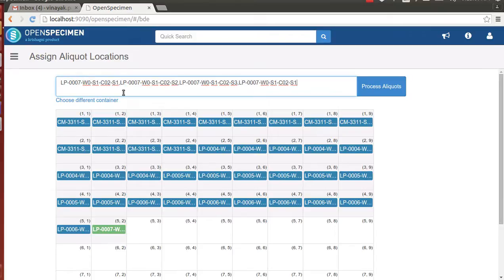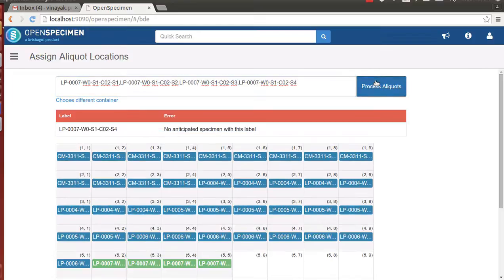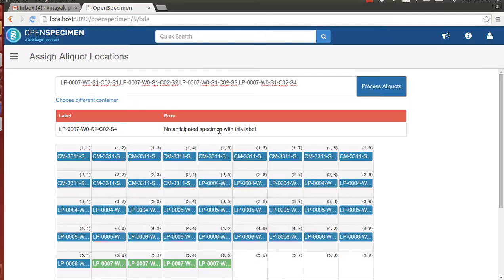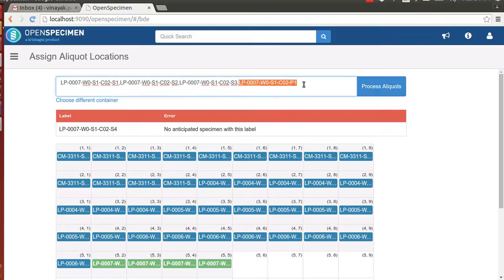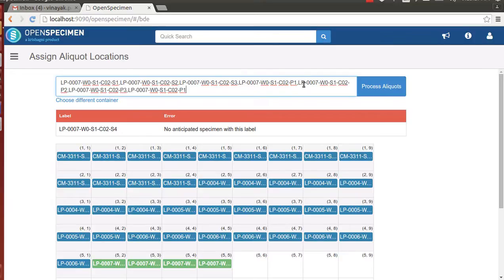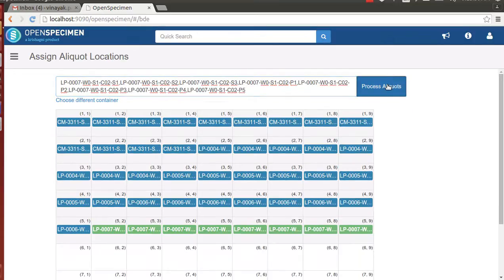Any invalid entry is highlighted here. Since S4 label does not exist and it is not anticipated by the application, the application highlights the label entered is invalid as it is not anticipating the label.